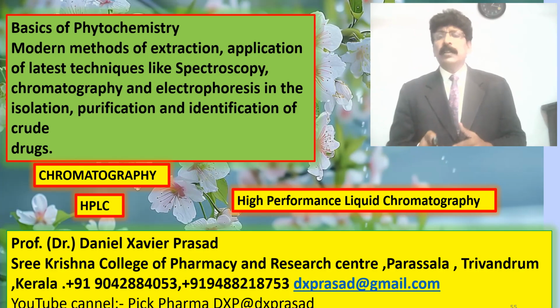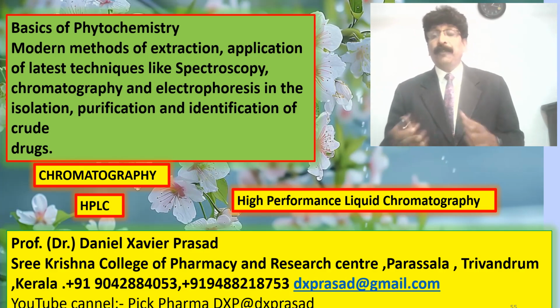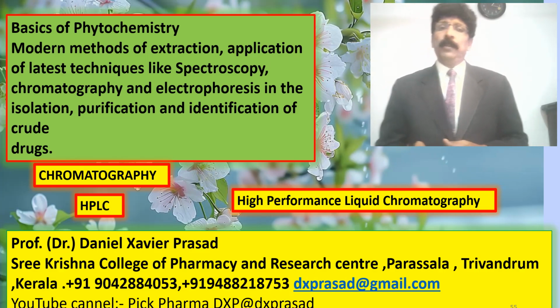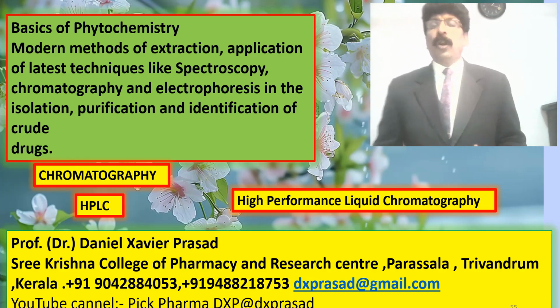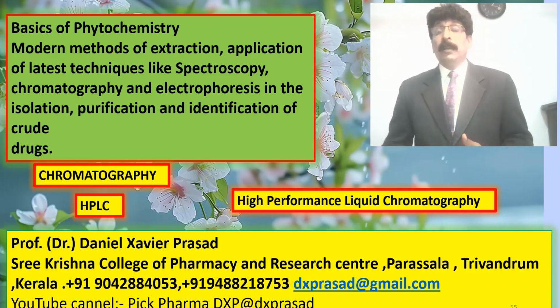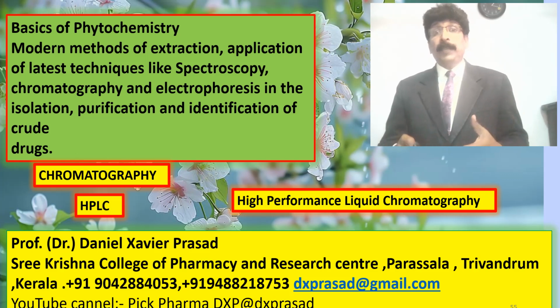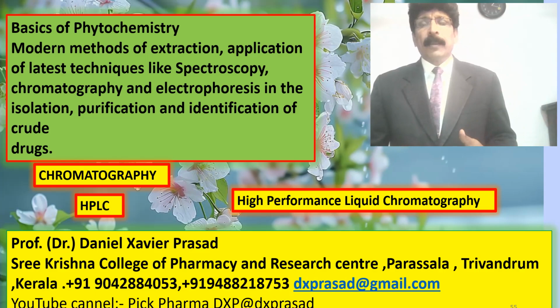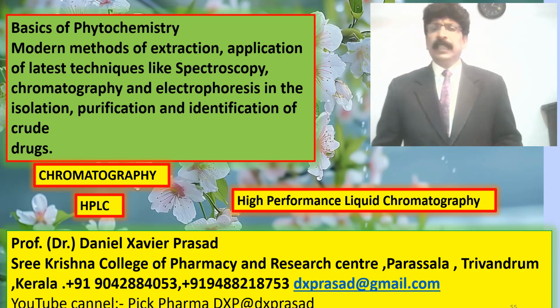Ultra performance liquid chromatography with very interesting small short ultra columns are also available. So we should know what is this column, what is this high performance liquid chromatography. After knowing about the basic chromatography in the last 2 classes regarding TLC and paper chromatography, this is a very interesting chapter.